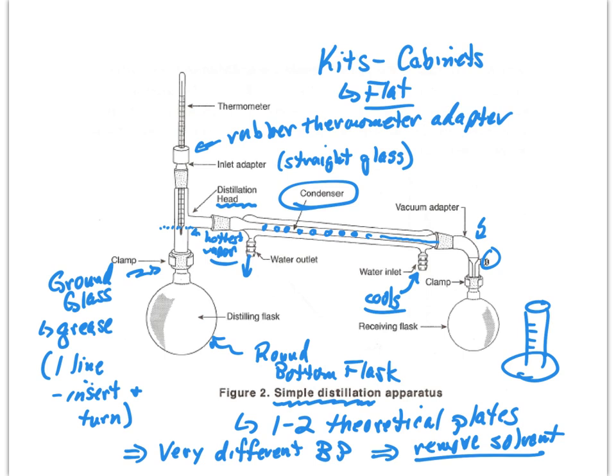Okay? So this is not what we're going to do this week. The lab procedure says to do both. We're not going to do simple, because the techniques are so similar. If we do the fractional distillation, then we will know how to do a simple distillation.